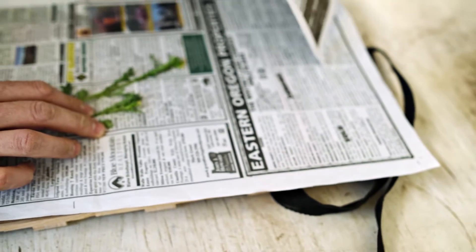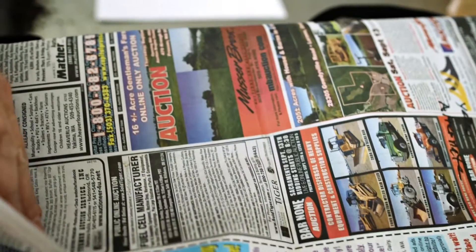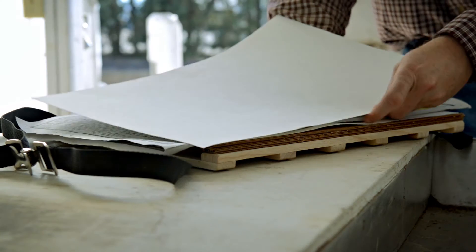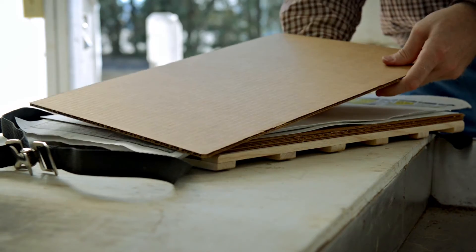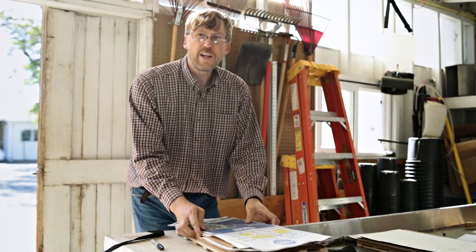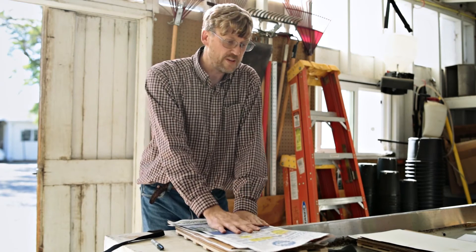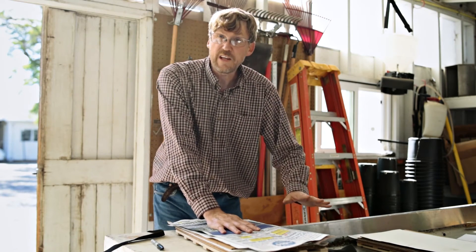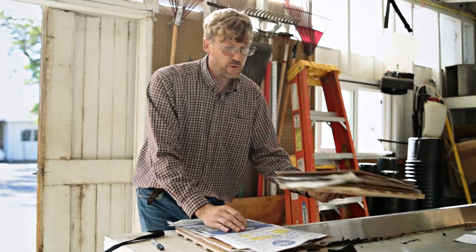Once you have your notes and labels on the paper, fold over the newspaper with the plant in the center. Then put on another piece of blotter paper, another piece of cardboard, and continue layering with more specimens if you have them. I had some additional plants that I pressed earlier, so I can include them here as well.